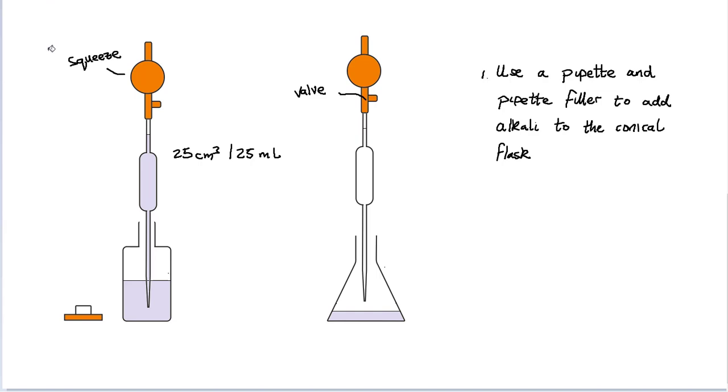This indicator is going to help us to know exactly when the alkali has been neutralized. In this case we're going to use phenolphthalein - I must admit it's a lot easier to say universal indicator, but we'll stick with phenolphthalein. A few drops of that when added to the alkali will turn the solution a pink color, and we're going to now transfer that to the burette.